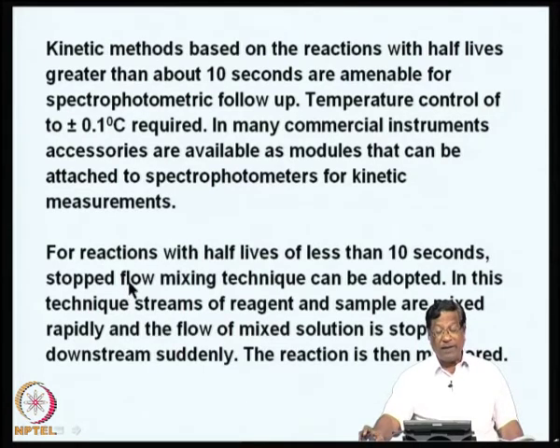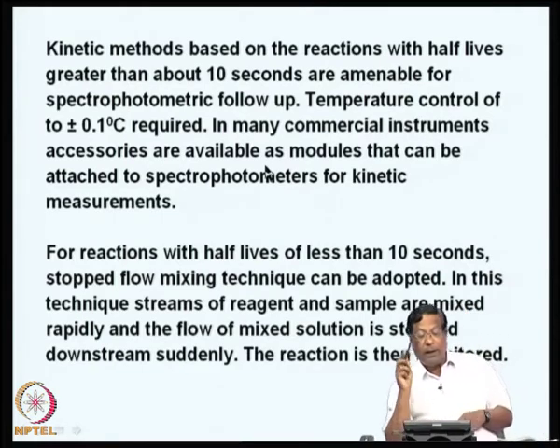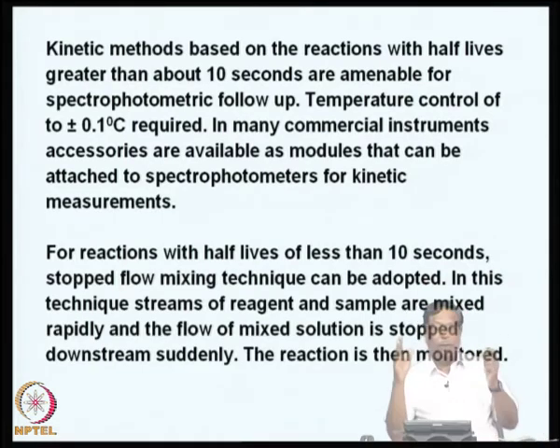So, in such cases what we do is we go for a stopped flow mixing technique. In this case, the streams of reagents, that is, two reagents coming through two different channels, are allowed to mix, and we allow a sufficient amount of time for them to react, and then stop the flow.